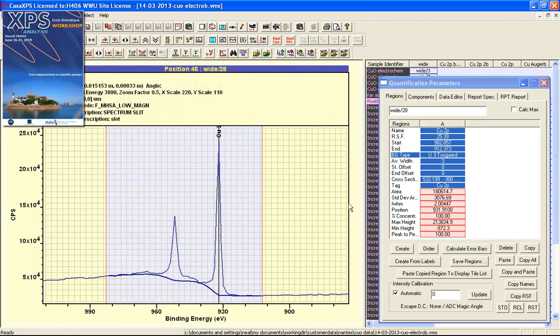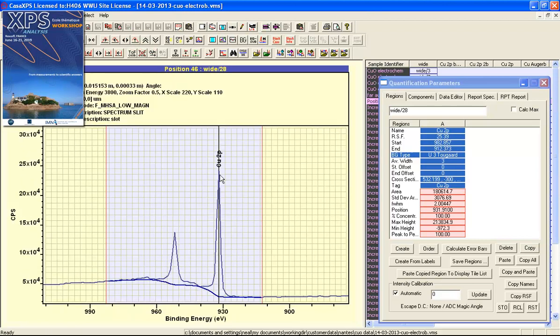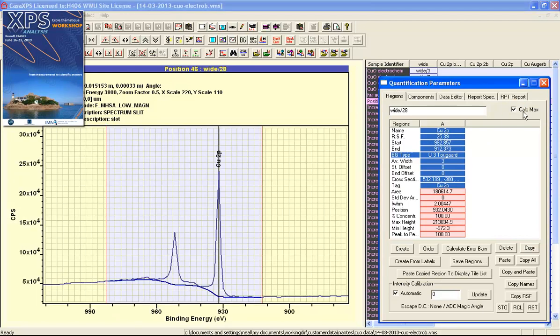In this case, it's approximately 2 eV. The position of the peak is another parameter that is reported. This corresponds to where the vertical line appears when the region's property page is topmost. This is calculated based on the data bins unless you tick this box which says calculate maximum.